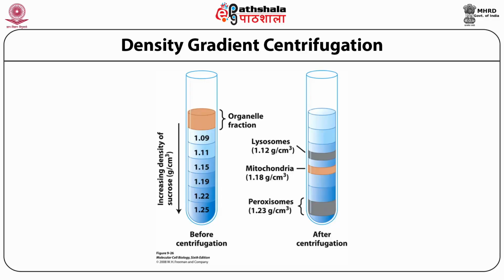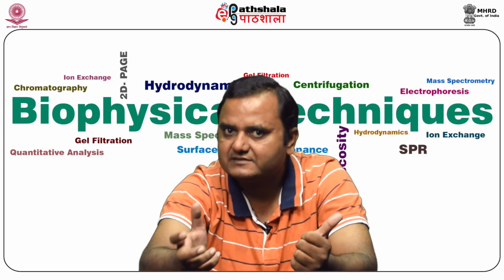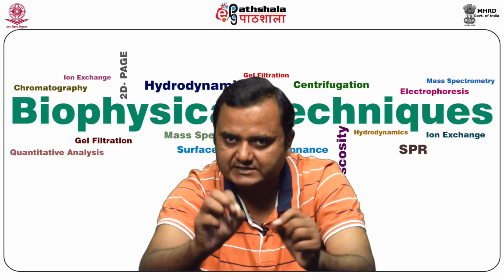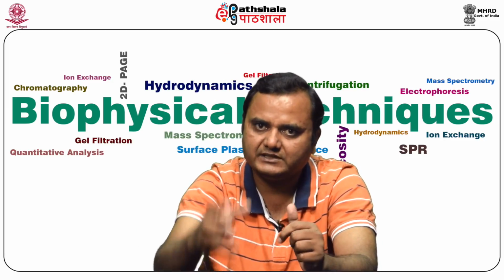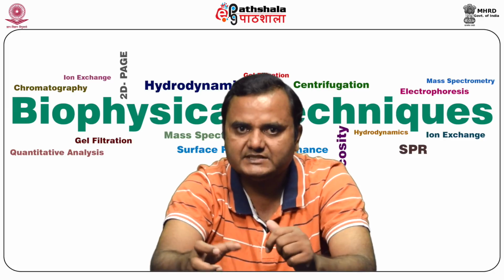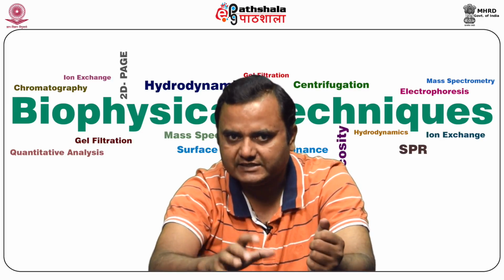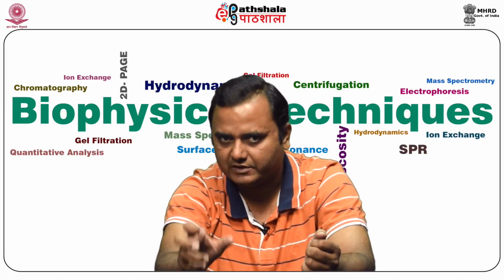So density gradient centrifugation usually makes the density of the medium, generally using sucrose, and then the organelles are fractionated on the basis of their different densities. As the name implies, density gradient centrifugation utilizes a specific medium that gradually increases in density from top to bottom in the tube. This means that under centrifugal force, particles will move through the medium and density gradient and stop at the point where the density of the particle is equal to the density of the surrounding medium.